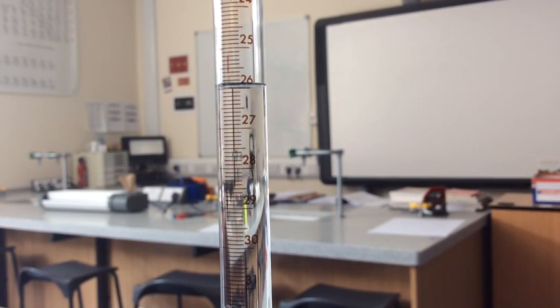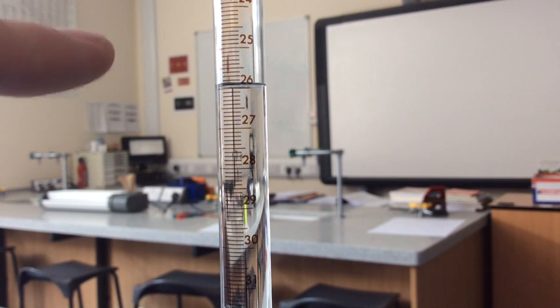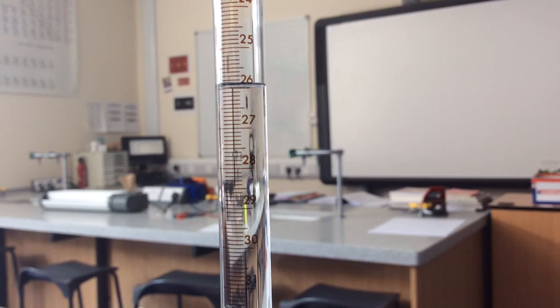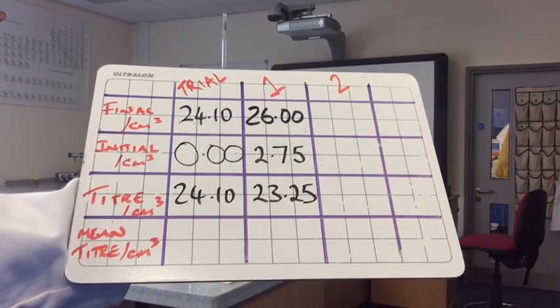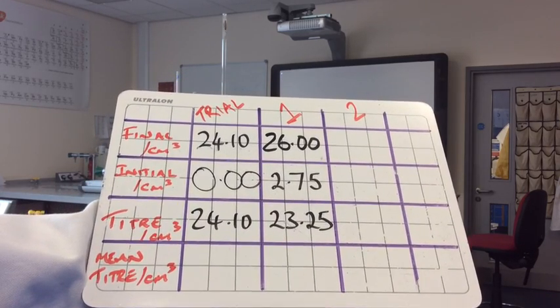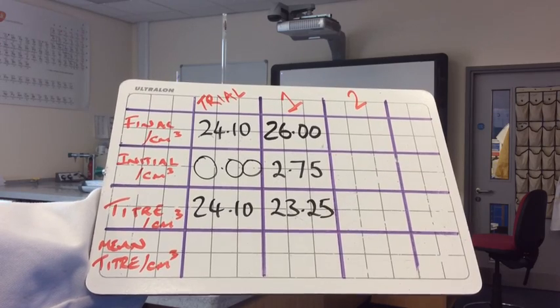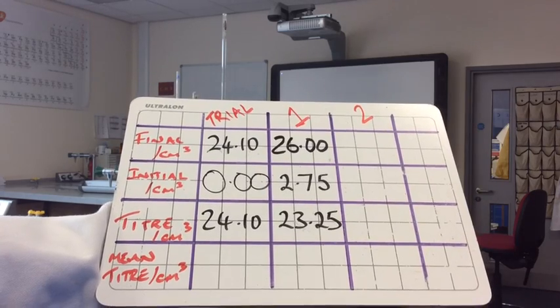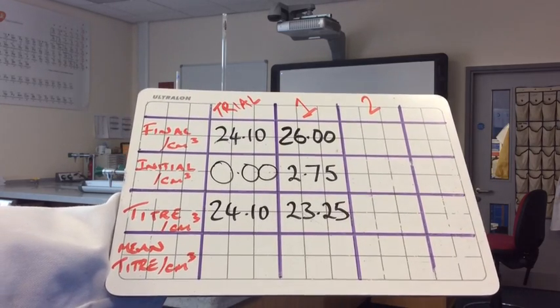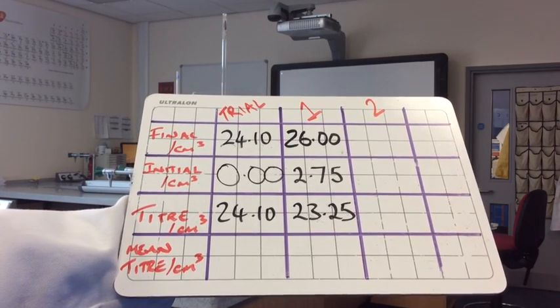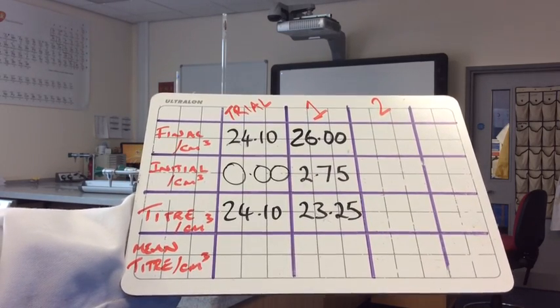So you can see there the meniscus is exactly on the 26 mark there. So we can safely say that that burette reading is 26.00. So there's the results table with the new information on. And you can see that the titra for the first accurate experiment is coming out at 23.25. So what I'm going to do now is do another accurate experiment and we'll get, hopefully, exactly the same titra. But we need to be within 0.10 of that, ideally.